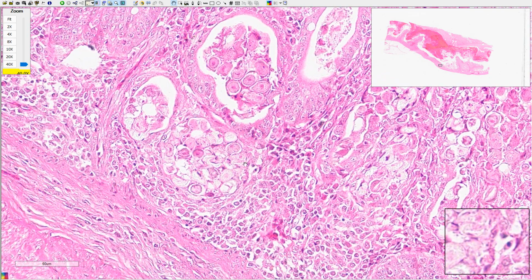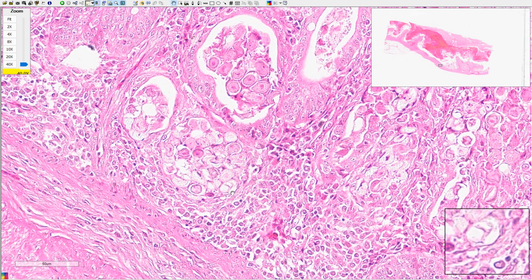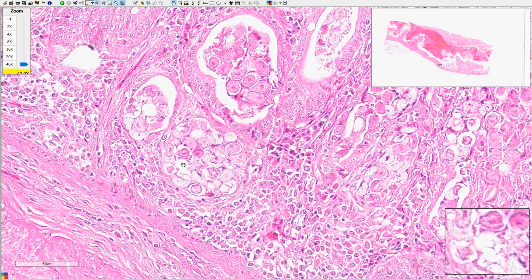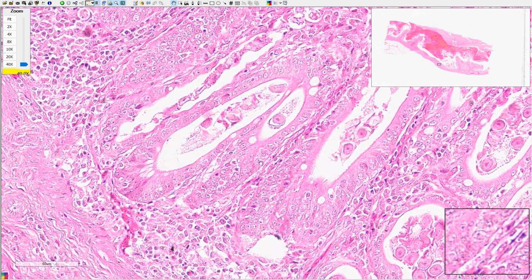Here, even all the crypts are already replaced by many stadia of coccidial growth, along with some clear cells with clear cytoplasm, indicating lots of goblet cells. Goblet cells producing mucus. Okay.